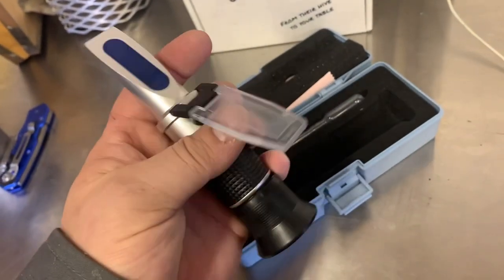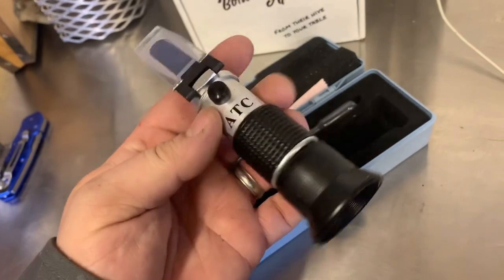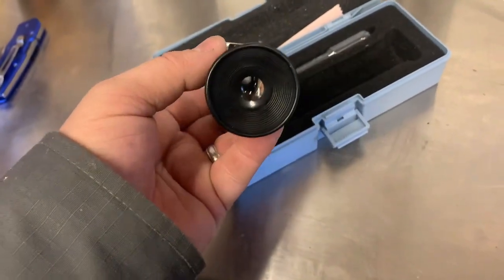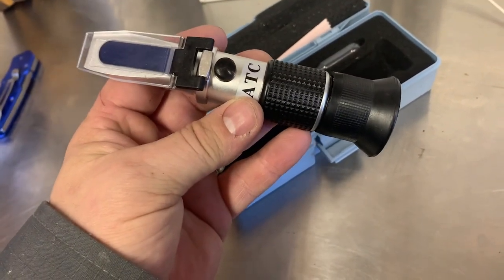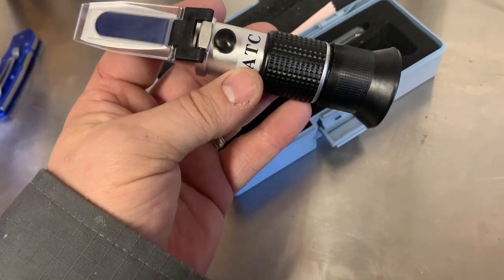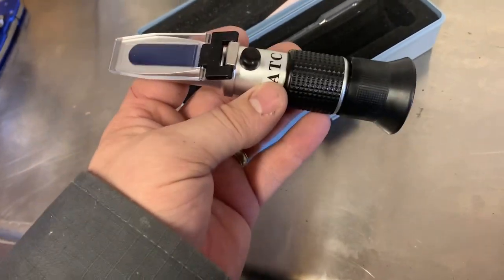This is just a fairly inexpensive one I bought online. It doesn't need to be very expensive. There are more expensive, more electronic-based refractometers, but this is all that's needed.